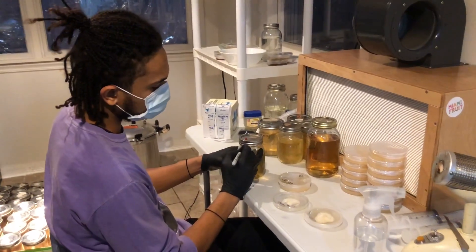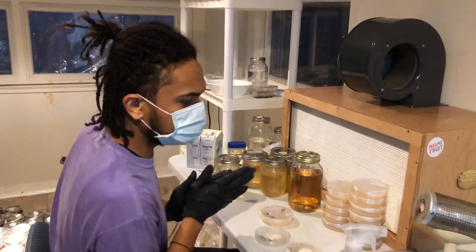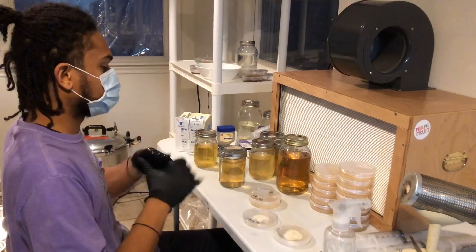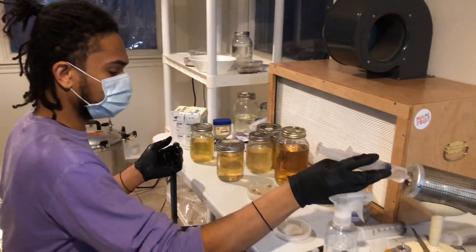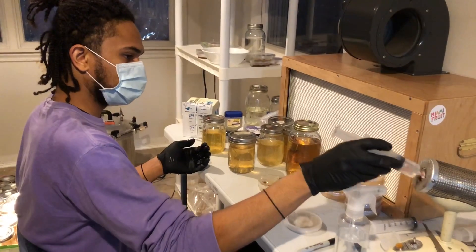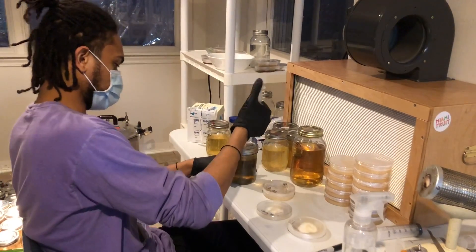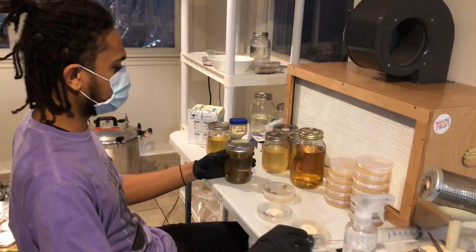I'm going to do the same on this liquid culture — label it the date. Before I leave you guys, I'm going to show you one other way that you can do liquid culture. This is what I recommend people do if they buy a new liquid culture: go ahead and take the liquid culture that you got in the mail, sterilize a whole new jar, sterilize the tip of your needle, make sure you spray down the syringe port, and then just stick some of that liquid culture and shoot it in there. That's one of the easiest ways to start a liquid culture.